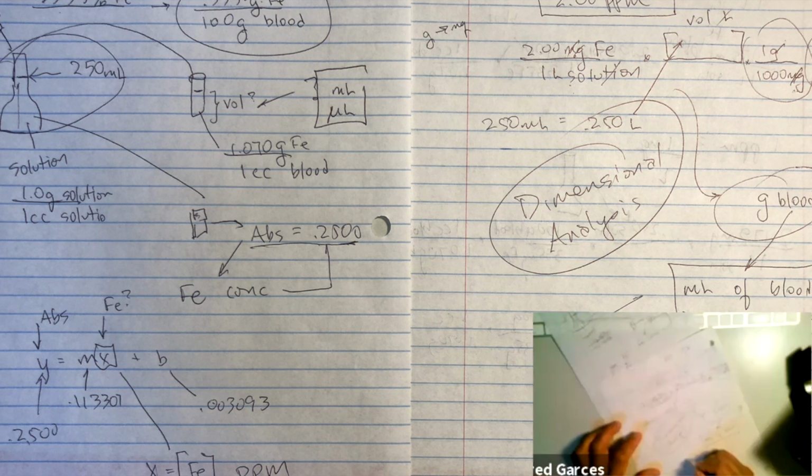But if you get a number, like I said, between 140 and 160 microliters, then you're in the right ballpark.